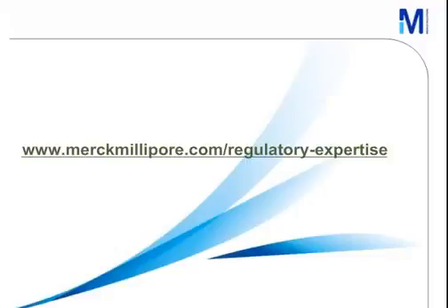The question to Barbara is: is the new EN ISO 11133 really mandatory for food and water labs? The previous version was only voluntary. Yes, thank you very much, Andreas, for this question. And to the audience, for all the questions you have sent, we will now answer some of these. The new EN ISO 11133 has been published as a full EN ISO standard. The previous one was only a technical specification. Especially accredited labs have to follow these EN ISO standards if available, because these represent the current state of science.